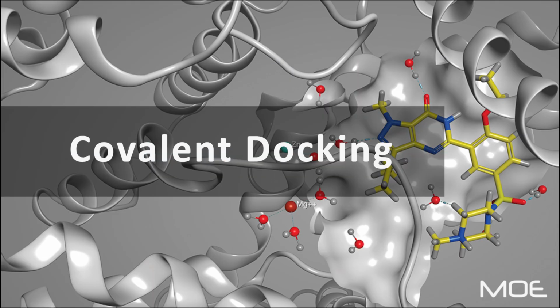Today I'm going to show you covalent docking. In covalent docking, we use virtual in situ reactions to covalently dock ligands and investigate how they bind to a target protein. Here, we can specifically define the reactive residue for covalent binding, or we can explore potential reactive sites in the receptor pocket which could participate in covalent binding. So let's get started.